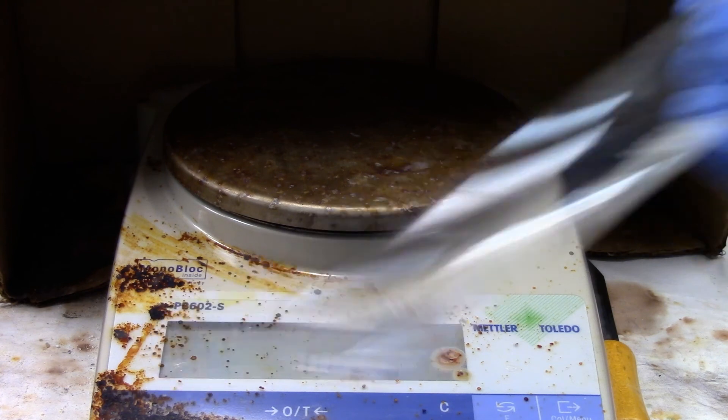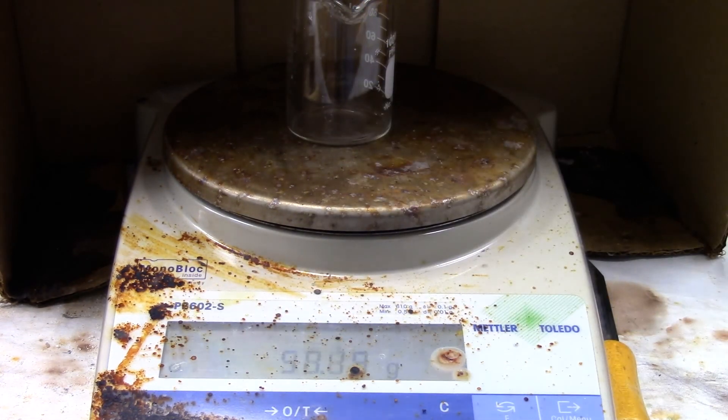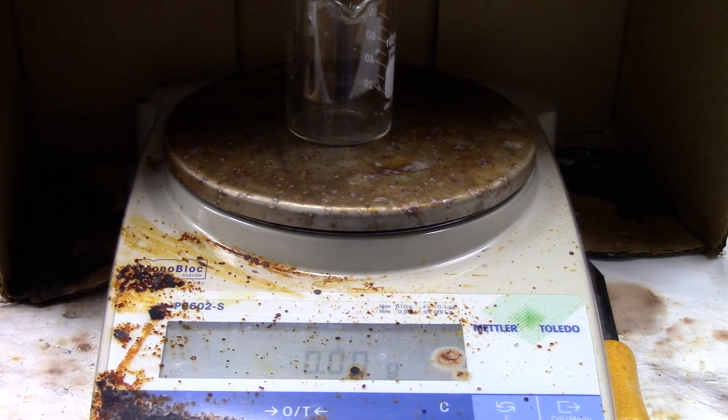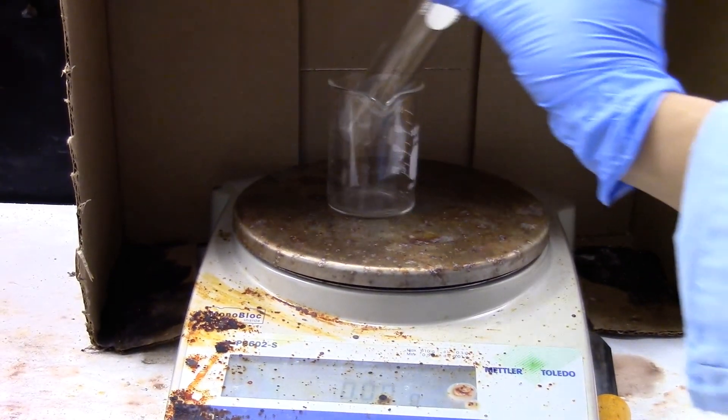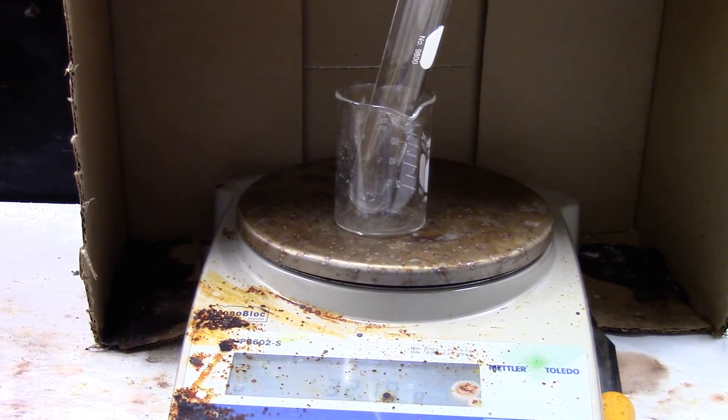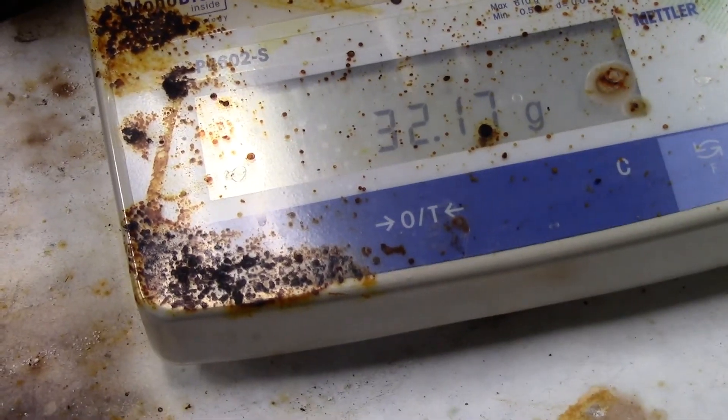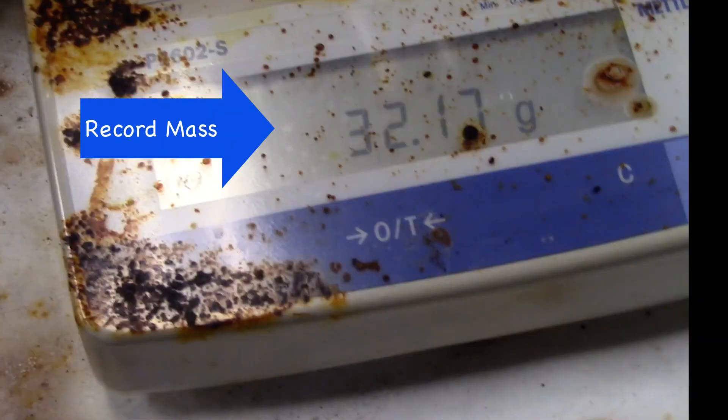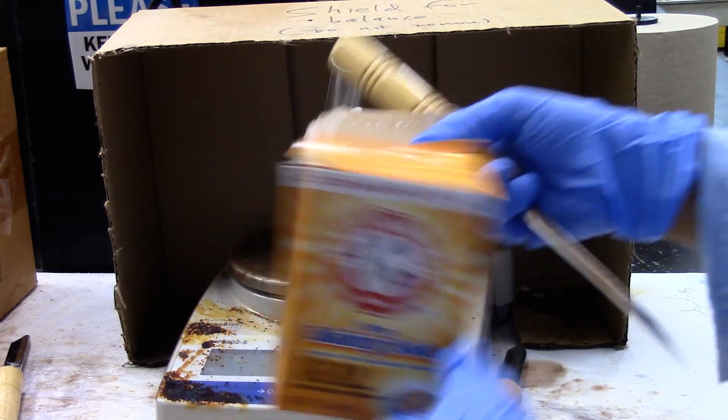So I'm going to weigh my empty test tube. For that I'm going to place a beaker, tare it, and then place my test tube in the beaker. Now I'm going to add some baking soda.